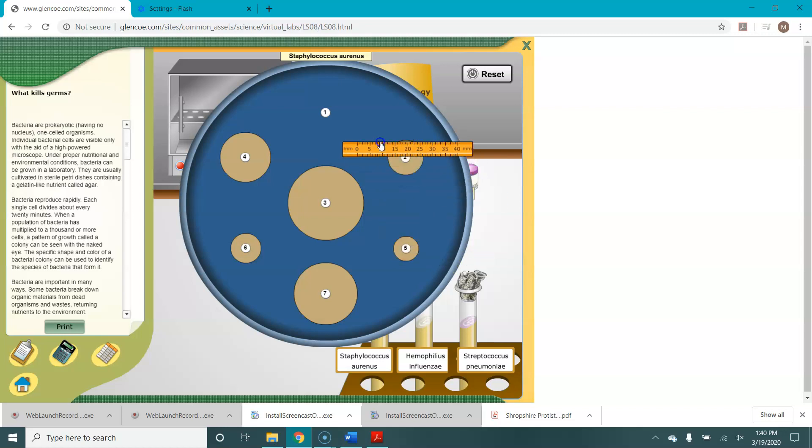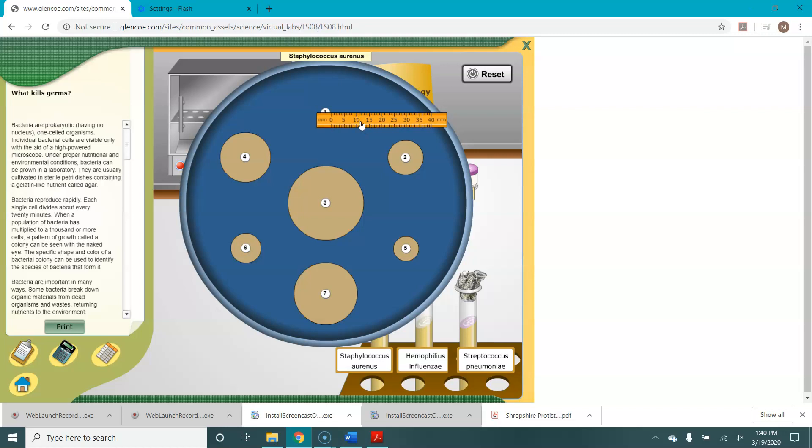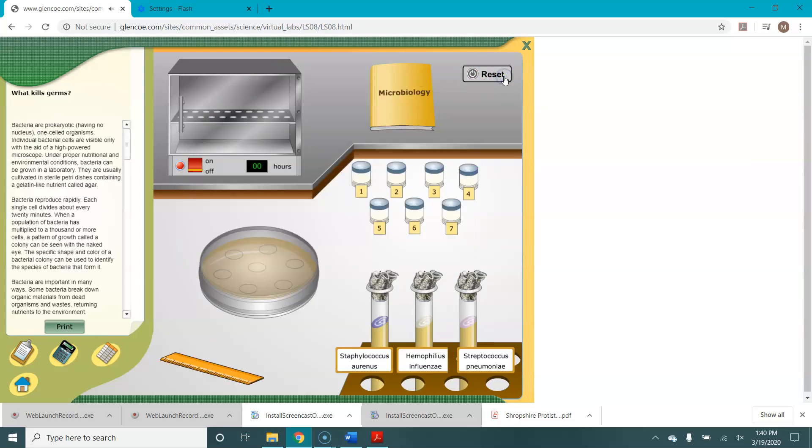What about this one with no zone of inhibition? Well, there's no zone of inhibition, so it's going to be zero millimeters. So we would then record this information in our data sheet and once we've measured all of them, we'd record it and then hit reset and it's time to move on to the next bacteria.